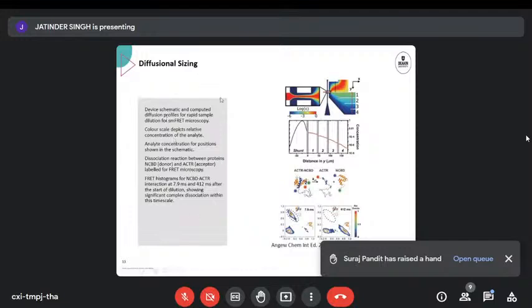Okay, so here we're looking at dissociation of a complex. So we get a complex being inserted into an H filter. And if it falls apart, the small molecules are diffusing into a further band and the ones in the center. And you can do different levels of spectroscopy depending on how far they've deviated here after the H filter, which then allows for the separation.